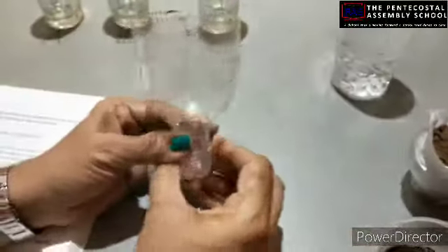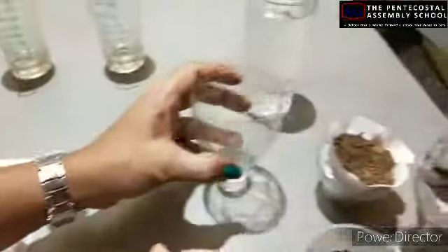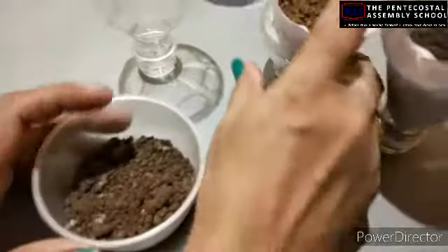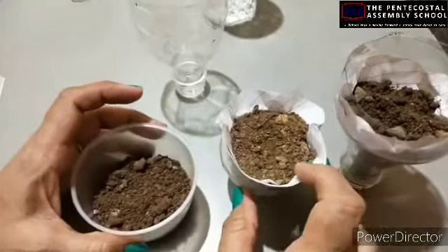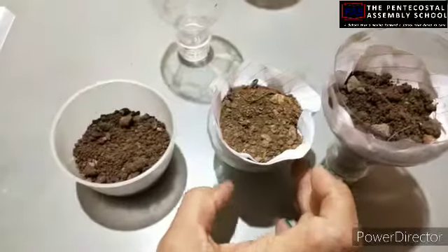Okay, and we need 3 funnels. If you don't have a funnel, you can cut a waste bottle and make a funnel. In this way I have made 3 funnels, and the 3 soil samples, as you can see, sample A, sample B and sample C, collected from different areas. One is garden soil, one is roadside soil, and one is collected from the pathway.